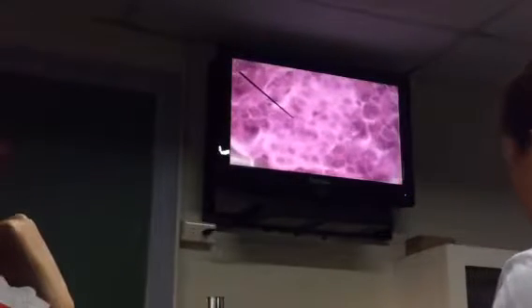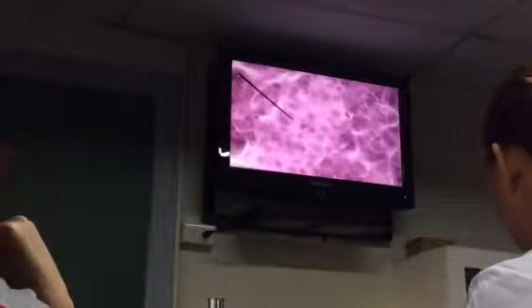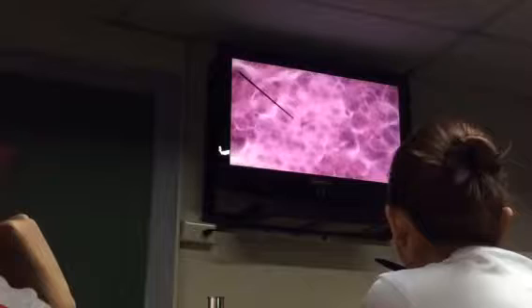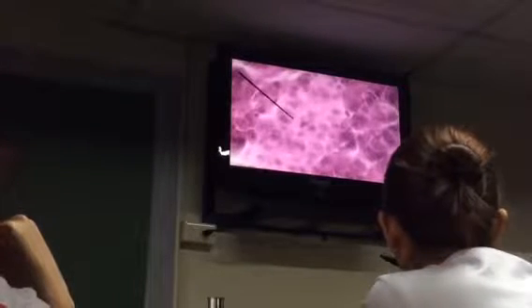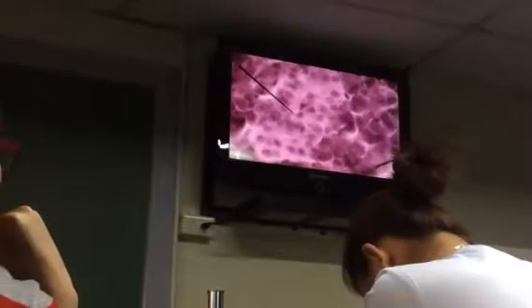You have here a group or cluster of cells. Maybe a side question would be to ask you which cell produces so-and-so hormone, and which cell is located at the center, which cell is located at the periphery, and so on. Okay? So that will be what you will see as far as your islets of Langerhans is concerned. Next slide is your testis, which is slide 66.